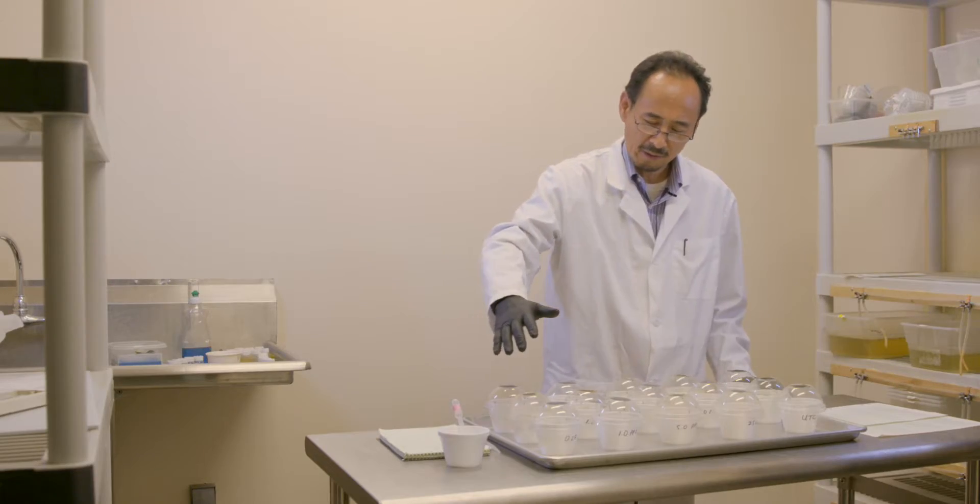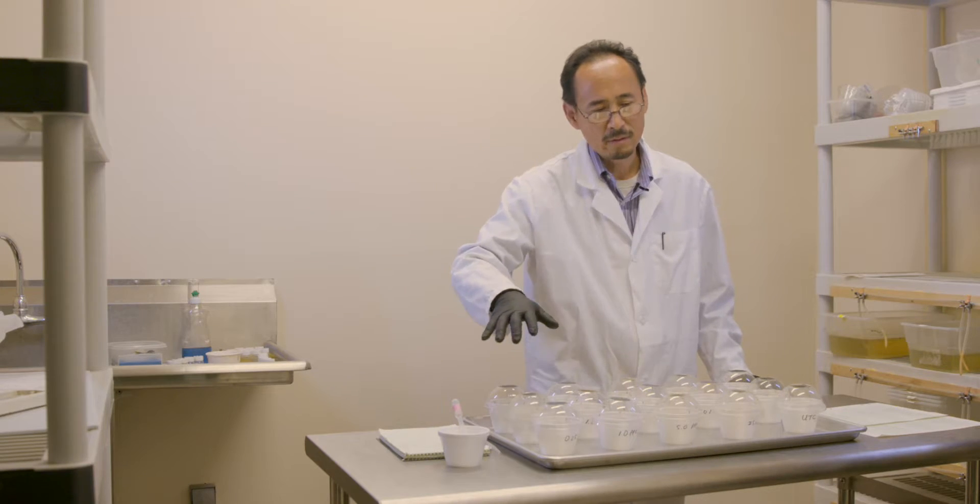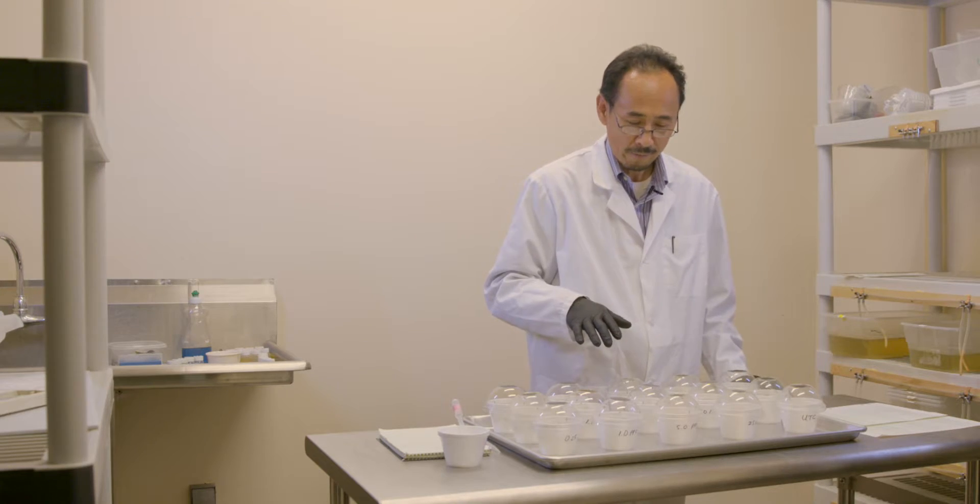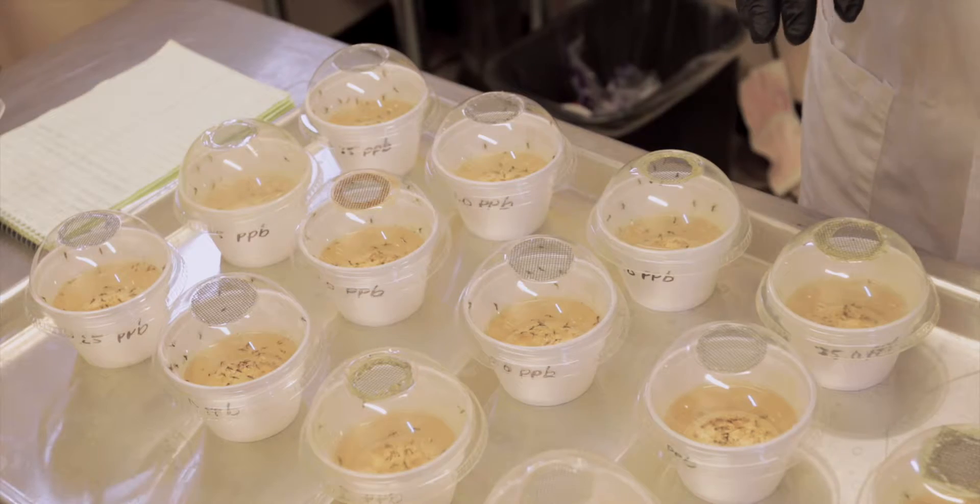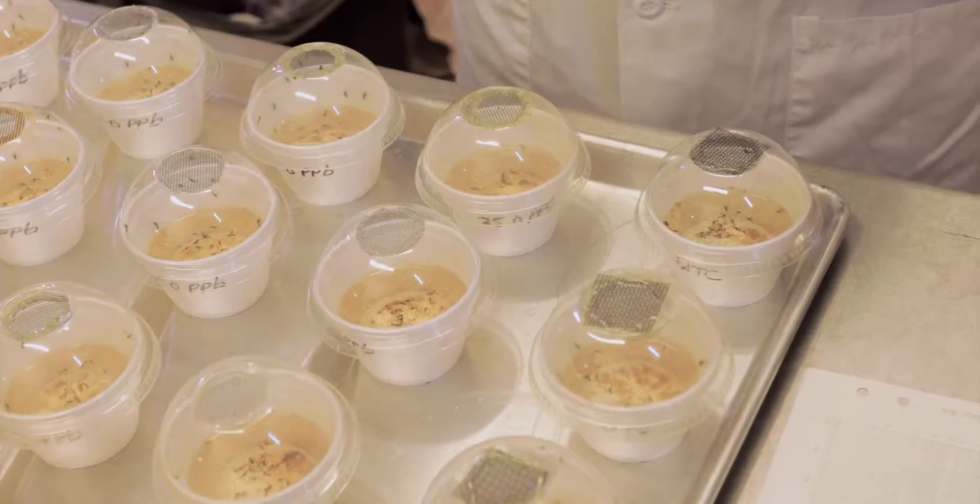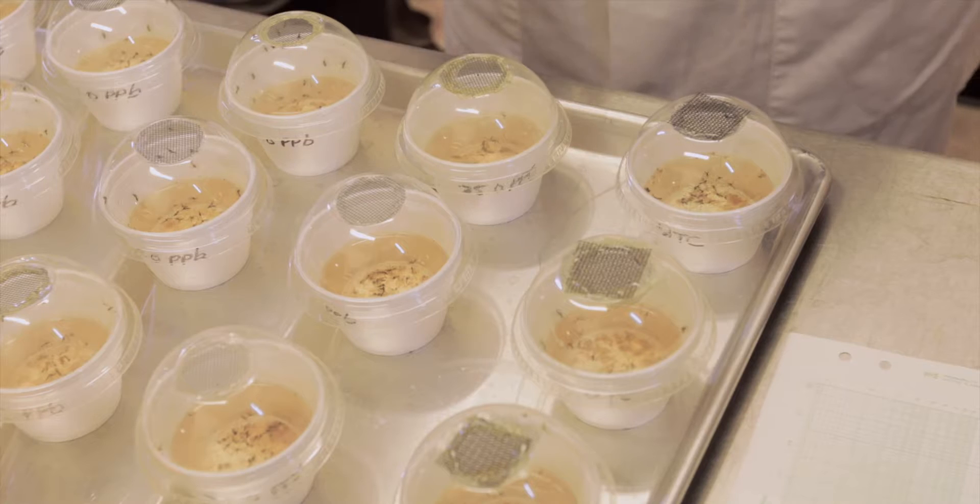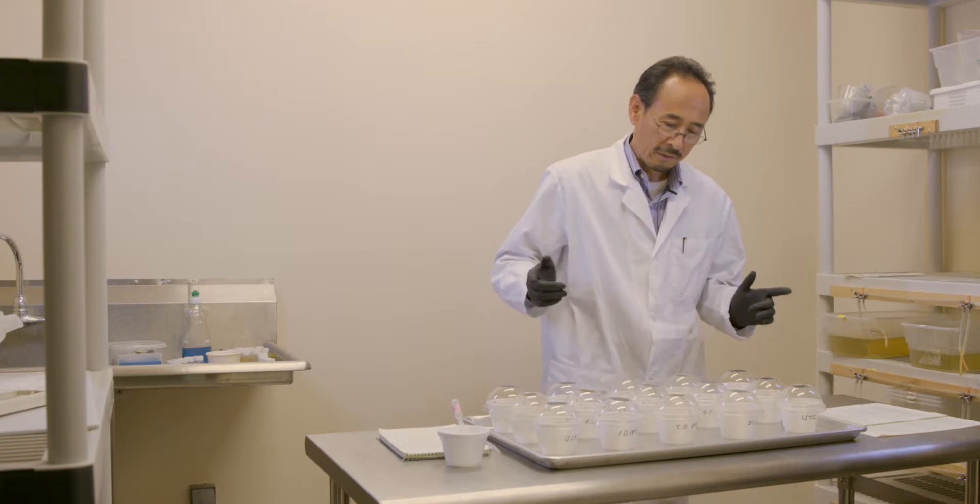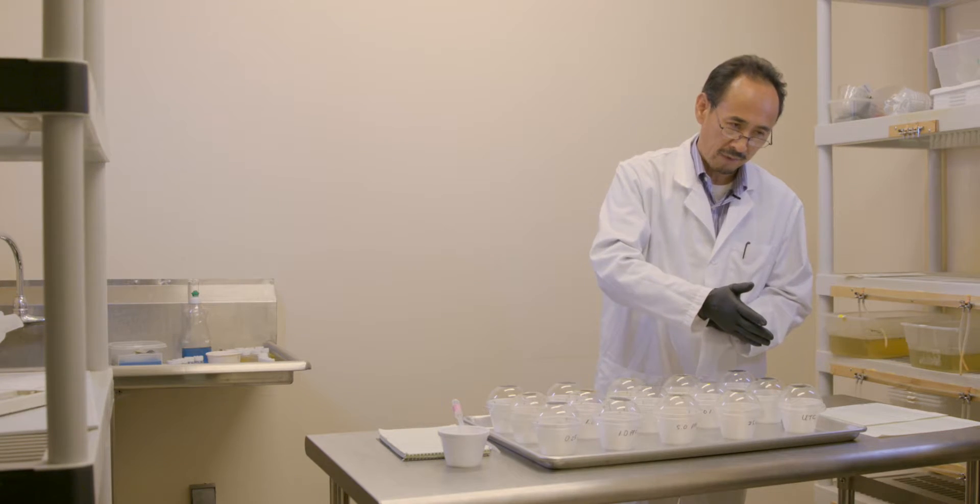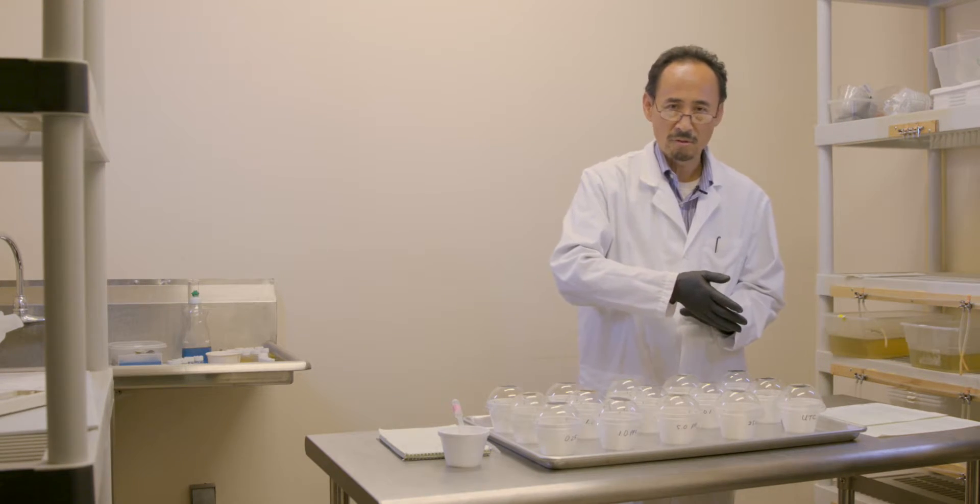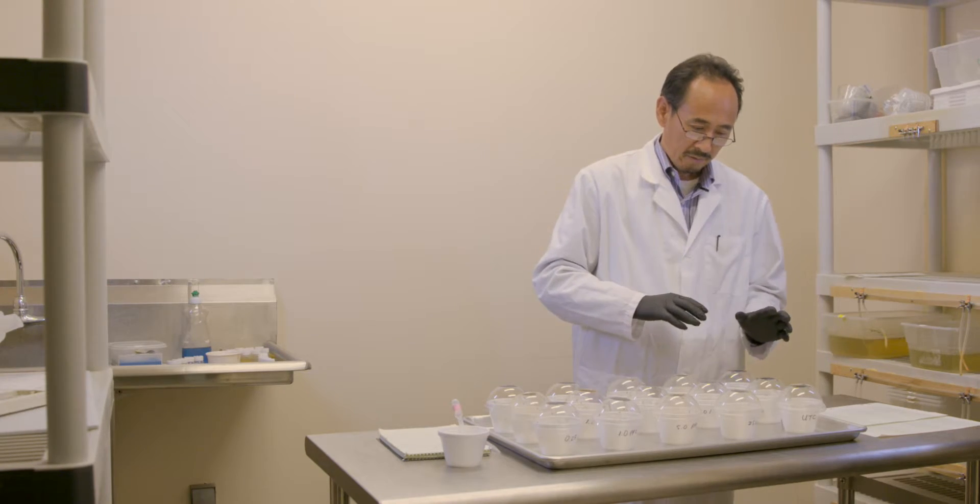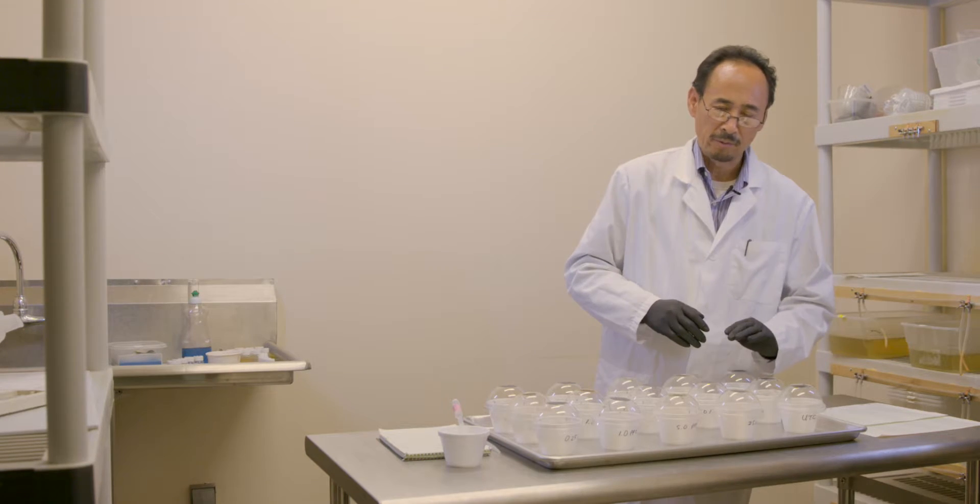If you see so many adult mosquitoes across the board, your dosage is too low. If you see almost none of them in the dome except your control, then you're probably over. You may have to redo it. The worst will be, regardless of your treatment, you see so many dead larvae in the untreated control. Something else caused contamination. Or you see very few adults emerge from the untreated control. That's not good either.